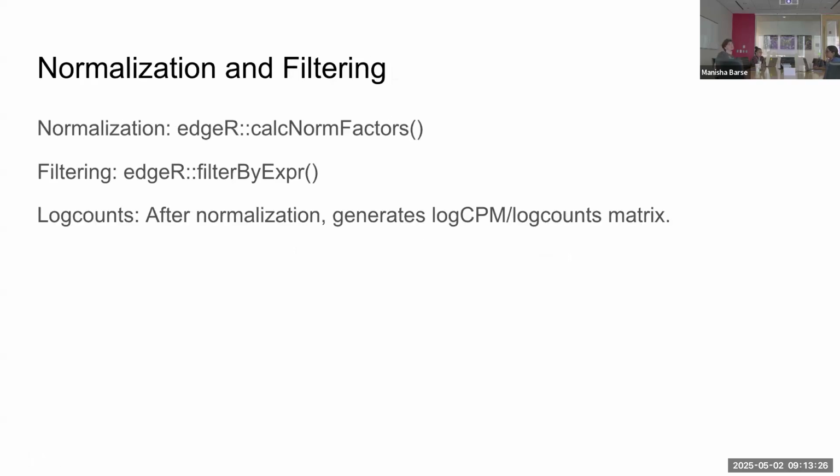For the normalization and filtering, as I mentioned, it uses the calcNormFactors function, and then filtering, and then after normalization, it generates the log counts per million matrix.